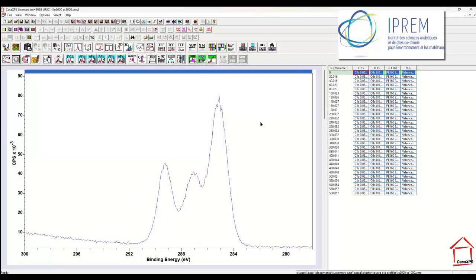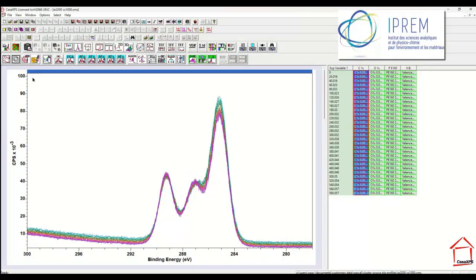This is an experiment that will allow us to see what happens to XPS data measured from a multi-layer material. In this instance, we're sputtering with an ion gun that is a cluster source, 2 kV with 1,000 atoms per cluster, and when we sputter for 20 seconds and repeat the XPS measurements, we end up with carbon showing some change. This is the carbon chemistry CH. You can see it is diminishing relative to the double bond carbon oxygen type chemistry.